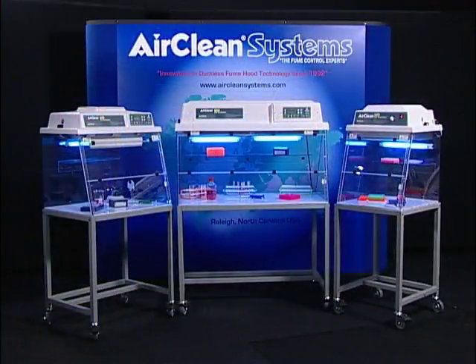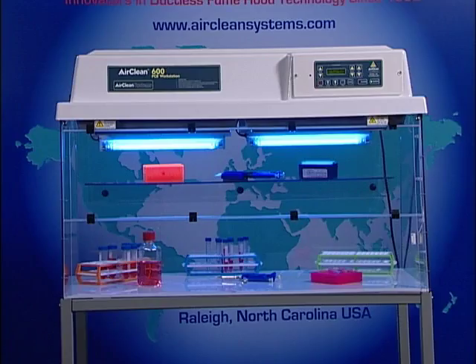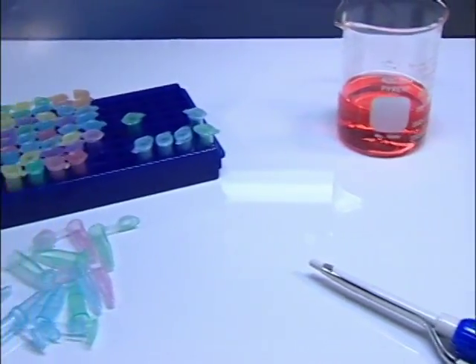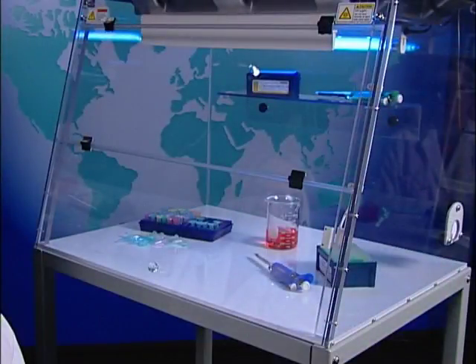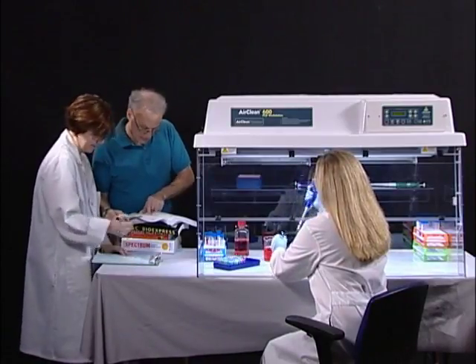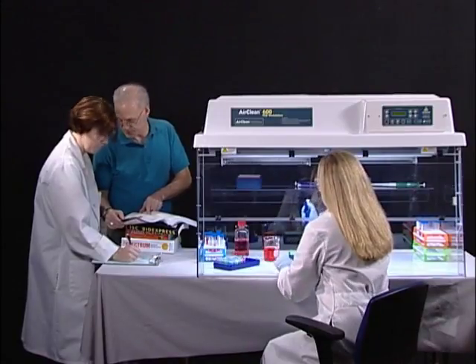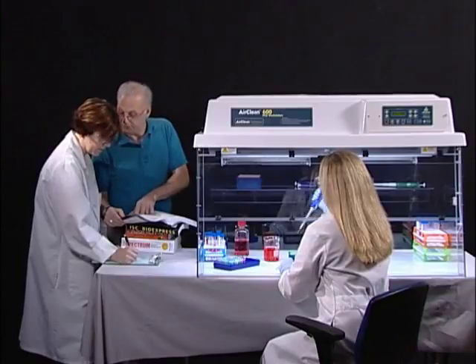AirClean Systems offers the combination workstation in three different widths — 24, 32, and 48-inch — with a standard 24-inch depth. AirClean Systems combination workstations allow the operator to create a mini-clean room on the laboratory bench. By incorporating an AirClean Systems combination workstation into your application, you can improve your odds and reduce the amount of reagents required to achieve your desired results the first time.